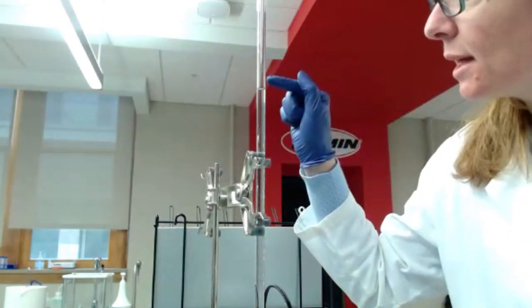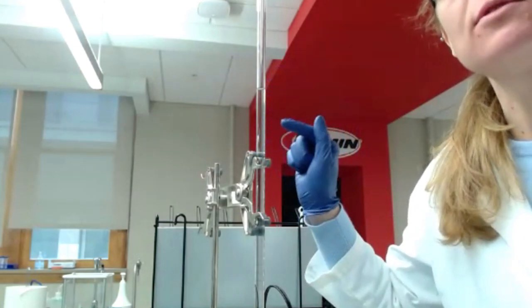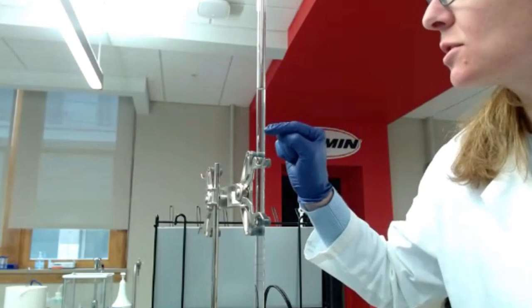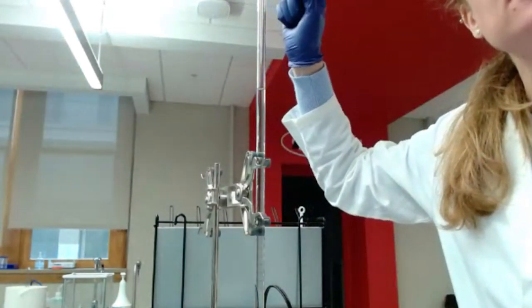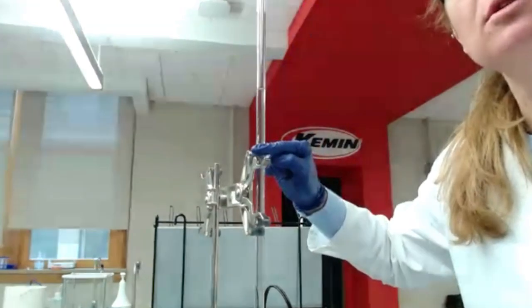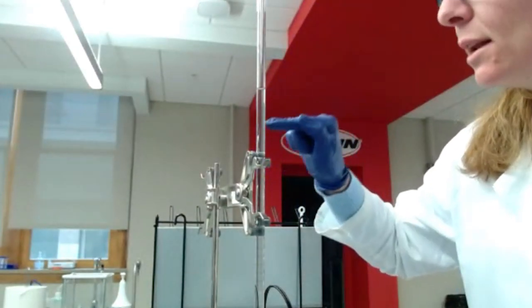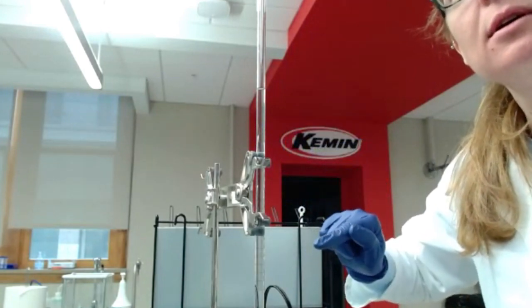Make sure that you read the graduation in the correct way. That's a source of error. Sometimes the numbers go up as you go up on the burette, and sometimes they go down. Here I'm at 24, then 25, 26, 27.